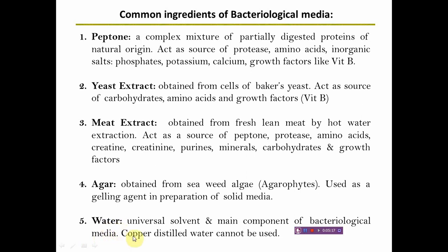Sometimes distilled water is used, sometimes tap water is used for preparation of the bacteriological culture media. But sometimes it is specifically stated that copper distilled water must not be used for the preparation of bacteriological culture media. Copper distilled water contains copper ions, and these copper ions are bactericidal or bacteriostatic.